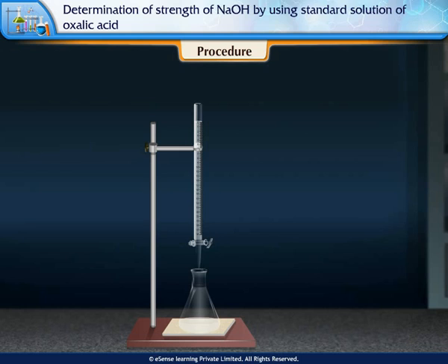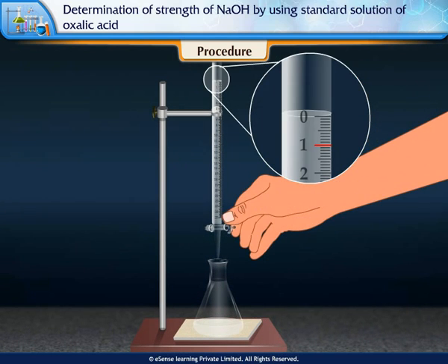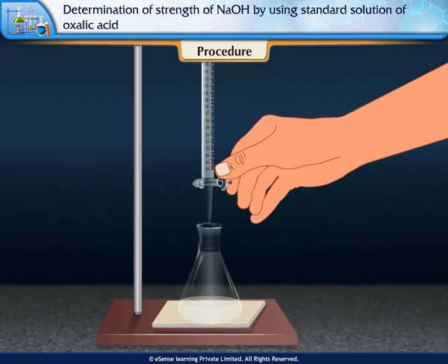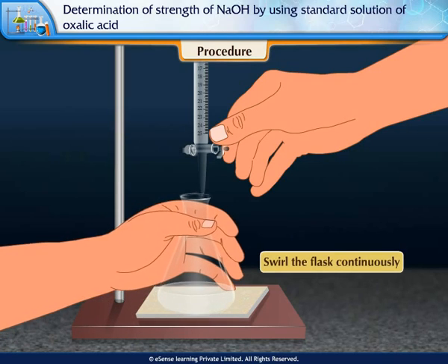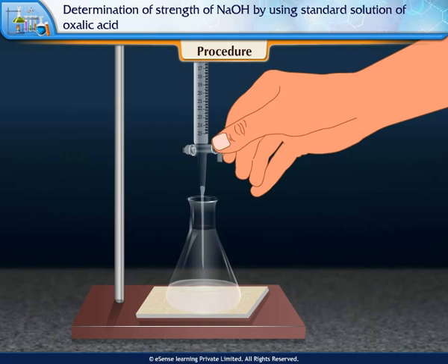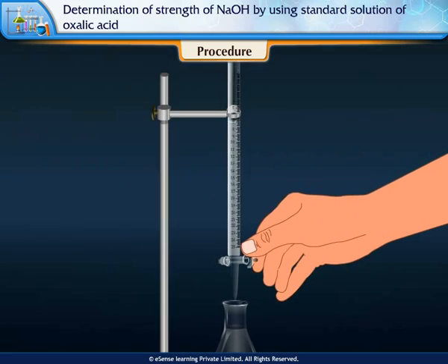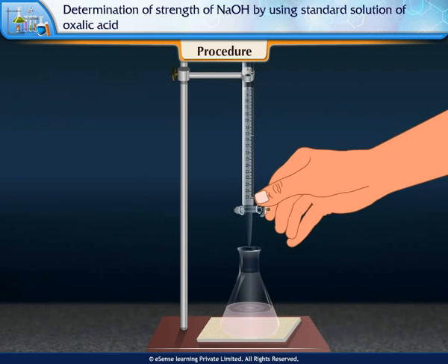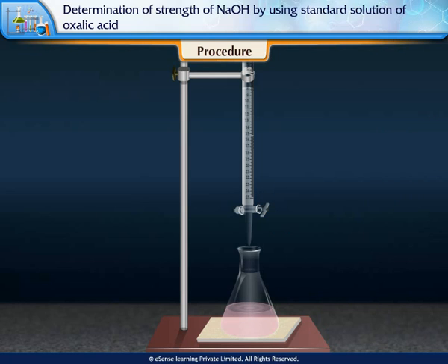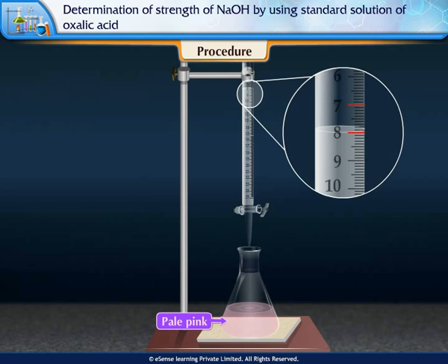For the pilot reading, add 1 cm³ of the burette solution at a time while swirling the flask continuously. Record the reading at which the color of the solution changes to light pink. There is no color change until 7 cm³ of burette solution is added. After adding 1 more cm³, the color changes to pale pink. Therefore, the pilot reading is between 7 cm³ and 8 cm³.